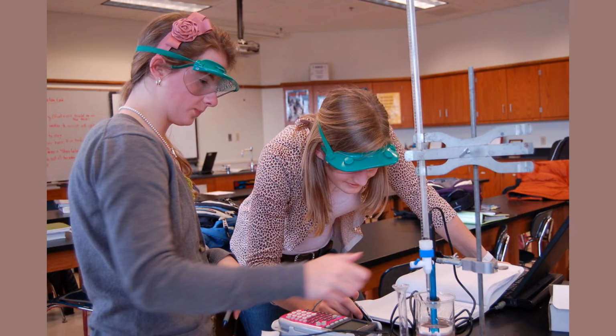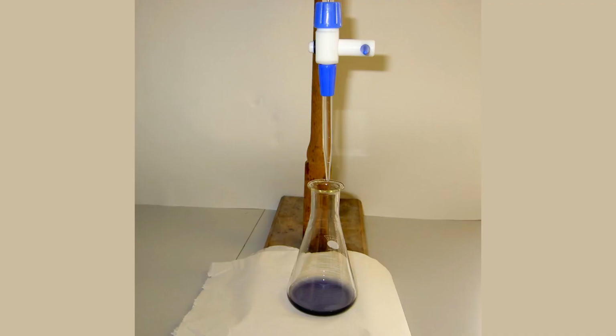In the next segment, we will discuss the concept of titration and how it is used to determine the concentration of acids and bases. Titration is a technique used to determine the concentration of an acid or base in a solution. It involves adding a solution of known concentration, the titrant, to a solution of unknown concentration, the analyte, until the reaction between the two is complete. The point at which the reaction is complete is called the equivalence point.